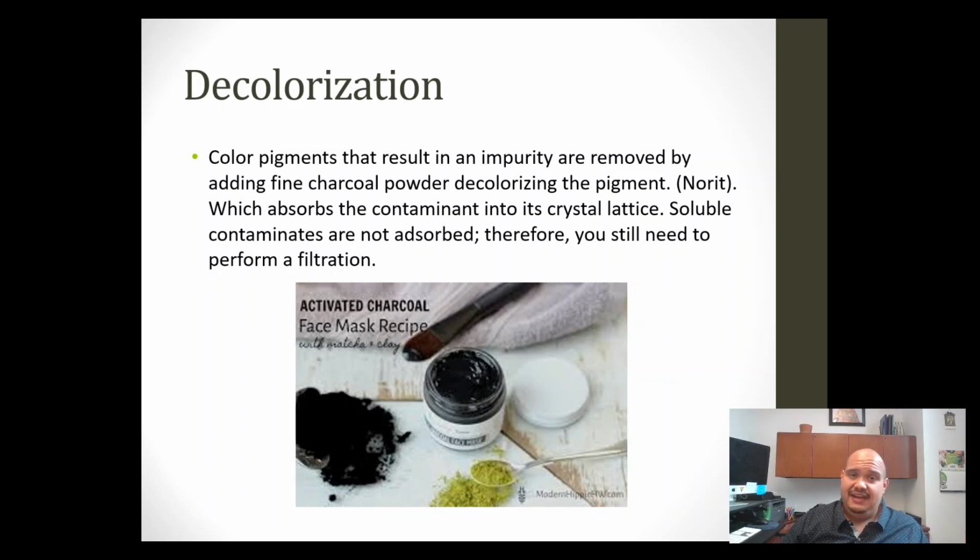If you have any questions, ask your professor. Don't just go by faith. Ask your professor and make sure that your observation is correct, whether or not you think that this compound can now go into testing, especially if it's an unknown. And once you get that data, you'll run a mixed melting point with the standard or with the unknown that you have, and you'll try to identify it that way. And remember, it's very important that you're sure and confident that your crystal is recrystallized appropriately and that it is pure. If it is impure, the melting point will be drastically different, and you will not be able to identify your unknown.